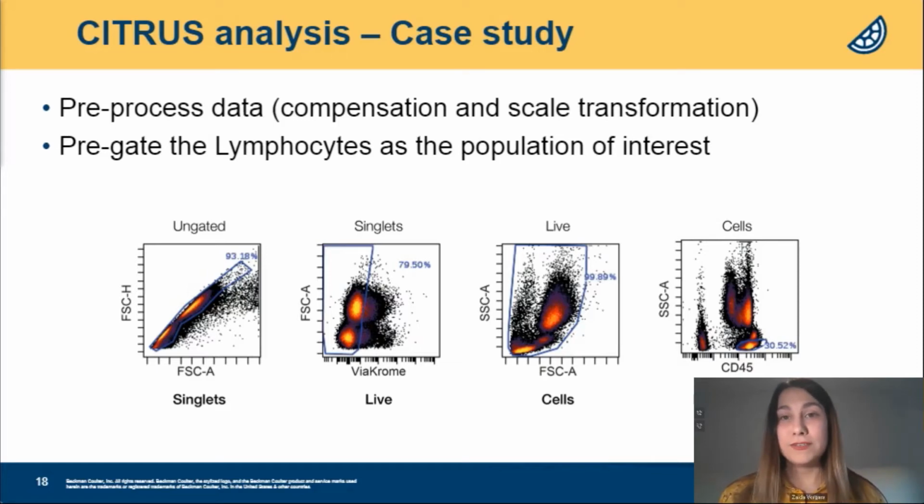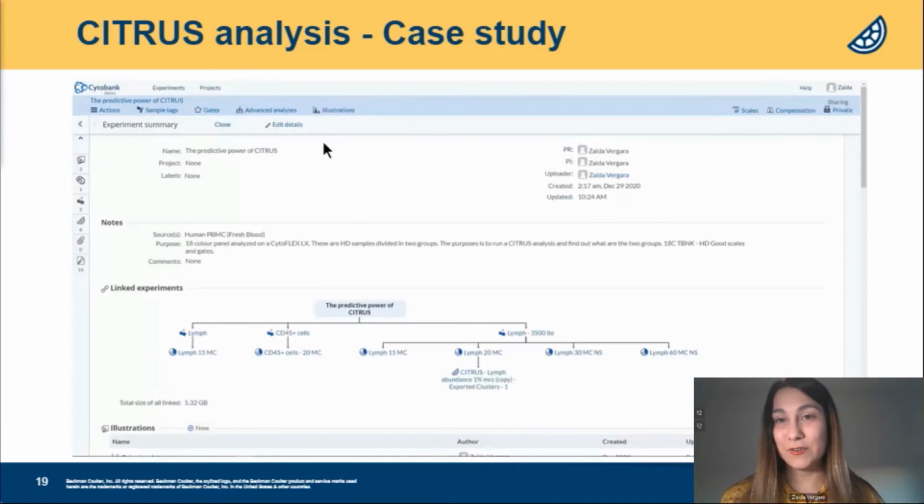So let's go to the Cytobank platform and run one Citrus analysis together. And you will have a second video that is going to show on your screens in a second.